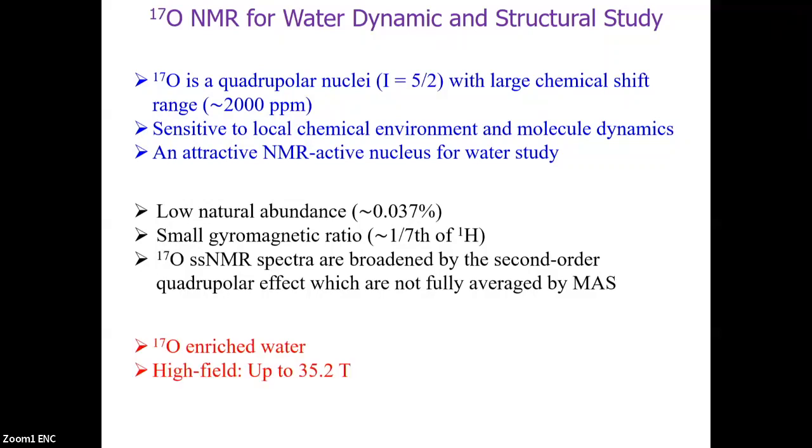But we can tackle this by using O-17 enriched water to enhance the sensitivity, and by going for high field, which here we used 35.2 Tesla, corresponding to 1.5 gigahertz proton frequency, since the second-order quadrupolar coupling is inversely proportional to the magnetic field.